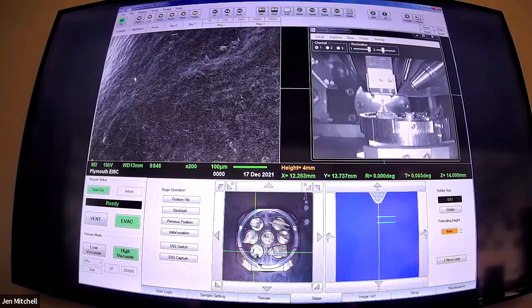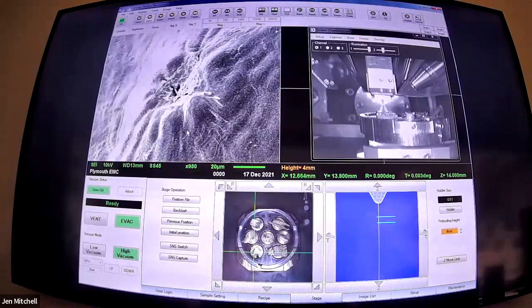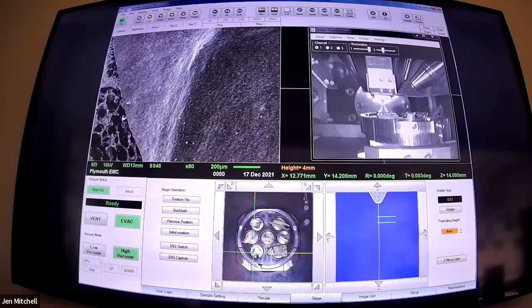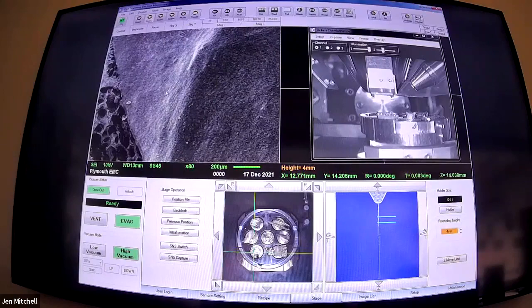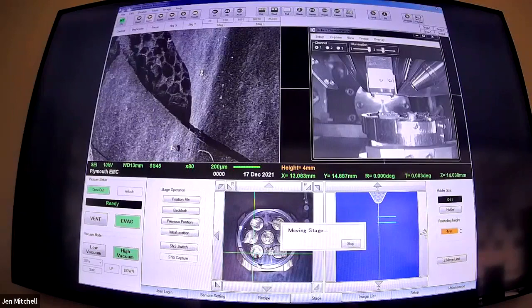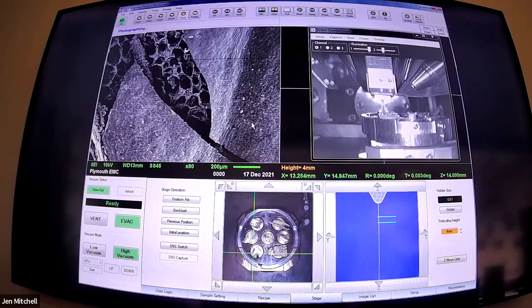There is a bit of texture, actually - you can see it as the leaf folds round. There's a tiny volcano shape there. And that's that spongy mesophyll again - we're now seeing it from the top side down. I wonder if it's like one of those veins that runs through. That can be a nice picture there - you can see all the textures all at once, sort of a comparison.